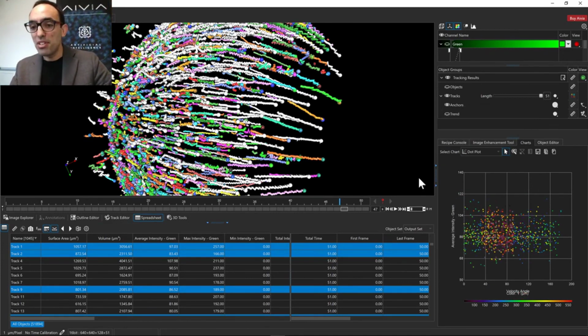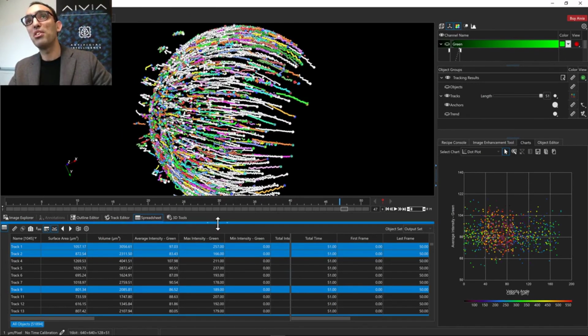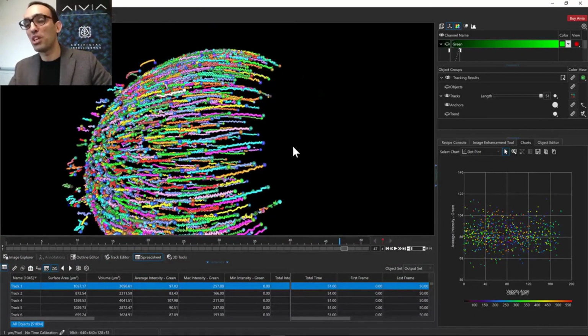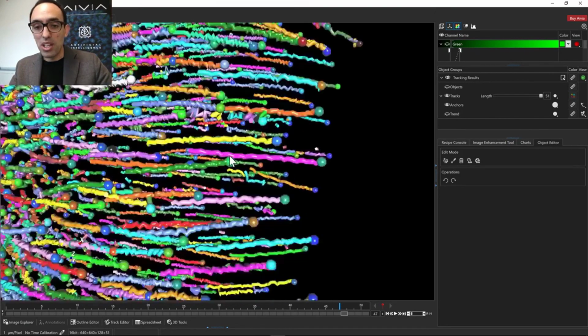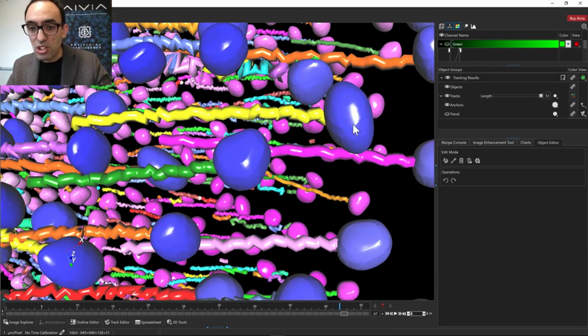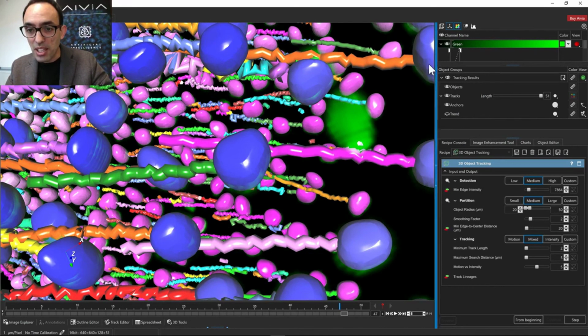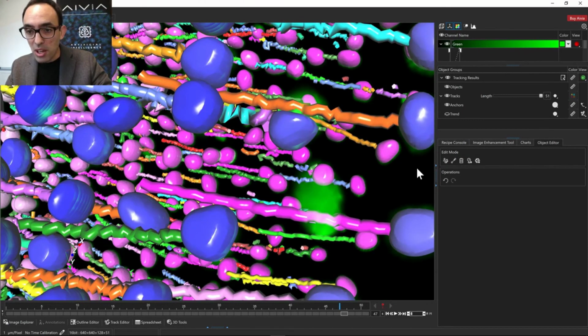Okay, I think I might have covered everything I wanted to cover today for track editing. Actually, there's a few things I didn't cover, but you will find them on our website or in other materials. One of them is that you can actually create objects on the spot in case an object is missing. You can go in and create one. I might actually show that. So let's say if this object here wasn't there. So I just delete this one so that I have something to edit, because I think this data set is actually quite accurate. So here is an object that I want to detect.